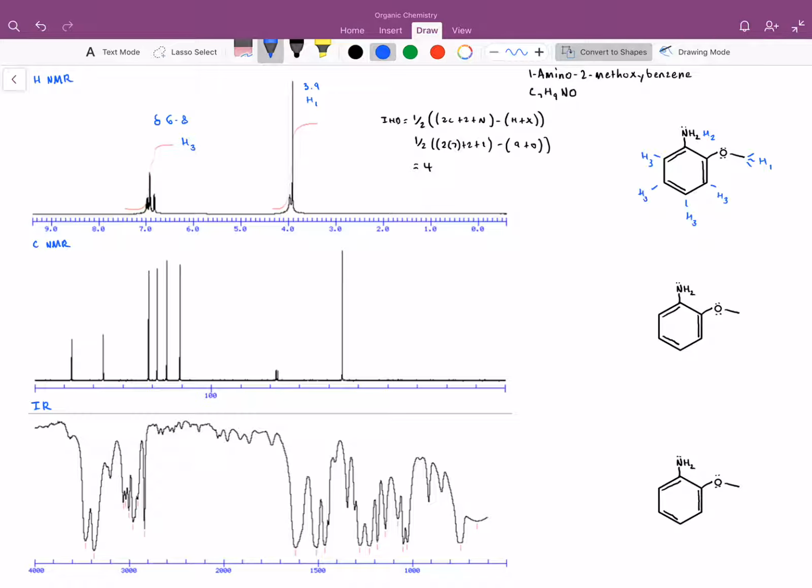So those hydrogens labeled H3 do all have slightly different shift values, and that's why this cluster of peaks is a little odd, as well as the integration curve. In theory, the hydrogens closer to the methoxy group, closer to the oxygen, should be a little bit more de-shielded.